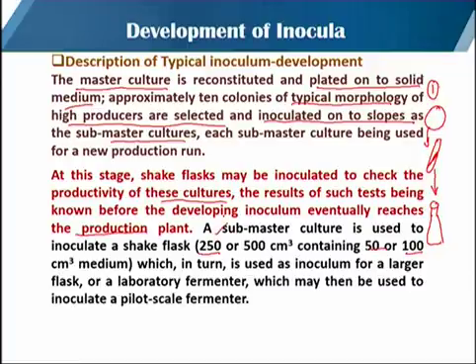As I have already told you in previous modules, if we are dealing with non-filamentous unicellular organisms, we can use 1/5 of the total flask volume. If we are dealing with filamentous organisms, we have to use 1/10 of the total volume. So for example, if the flask is 250 ml and we want to develop bacteria, we add 50 ml of the medium. If we are dealing with filamentous organisms, we just add 25 ml of the medium.